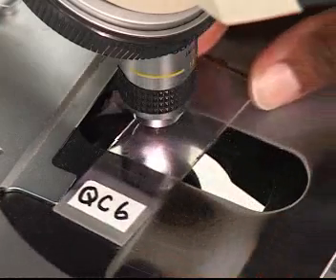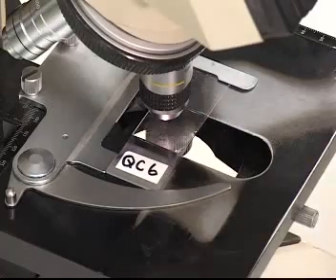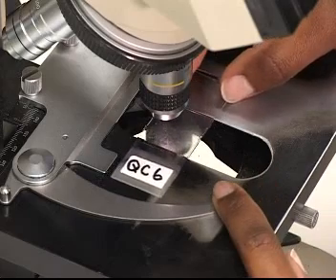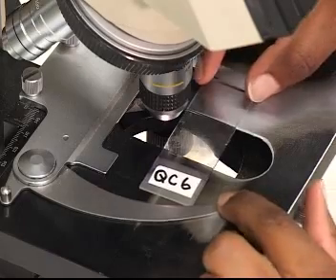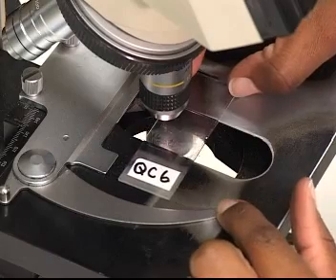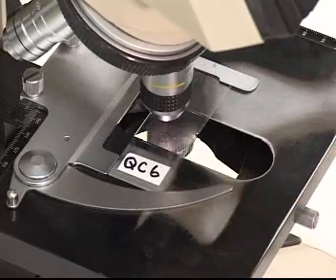Now that we have set up our microscopes, we are ready to study a mounted specimen or slide. The first step is to place the mounted slide on the stage with stage clips. Remember that the stage is the flat part here, and these are the stage clips. Next, you move the slide with your thumb and finger until the object is at the center of the stage opening and on the path of the light coming from below. The stage clips will prevent the slide from moving out of the field of vision.